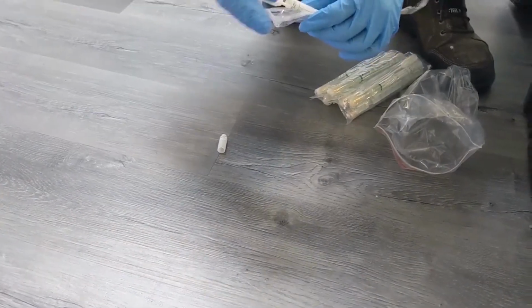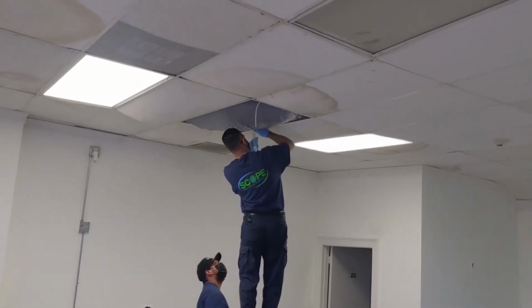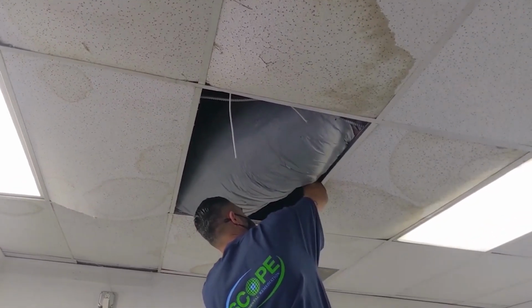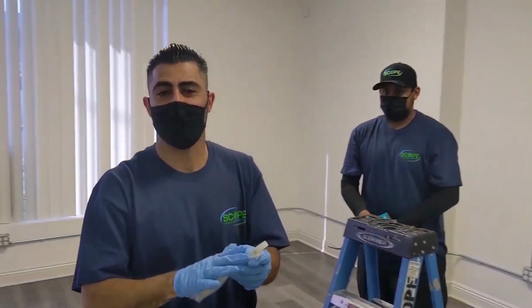You put it into the capsule, seal it up, and put that into the Ziploc bag and straight to the lab itself. So we're taking the sample direct right above the ceiling itself. You want to wipe the area that you're concerned about by not touching the Q-tip itself. And once you get that, you put it straight into the tube. So with this direct sample itself, this goes directly straight to the lab.